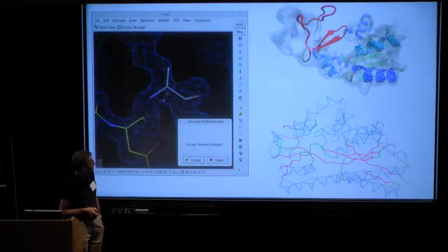So we wanted to solve this problem, well, in a slightly more appropriate fashion, and also one where we wouldn't need all these restraints. So Christian and my team spent almost 2 years on this. On the one hand, we have the sample, and we do know, with all the normal caveats that molecular mechanics might not be good enough, you might need quantum mechanics or something, but it should be possible to describe the conformational space of these molecules with physics. Same thing there, that there is an entire process. We can vitrify it, we can do a microscope experiment, we can calculate 3D densities and everything, and then we should be able to get back and somehow integrate or compare that with the molecular mechanics.